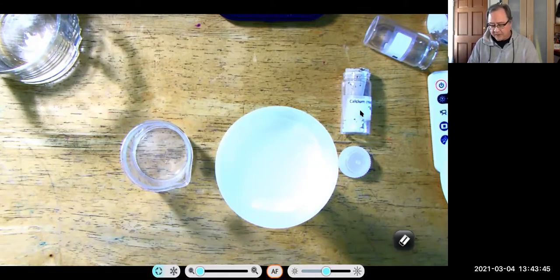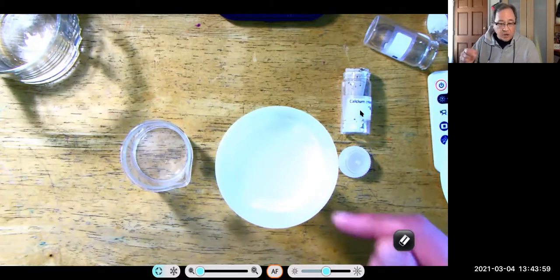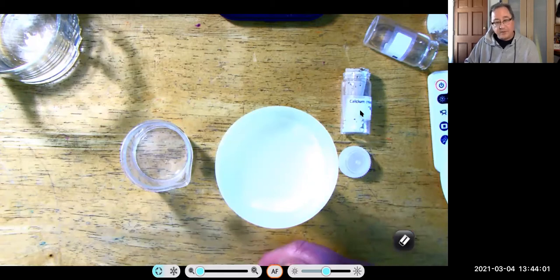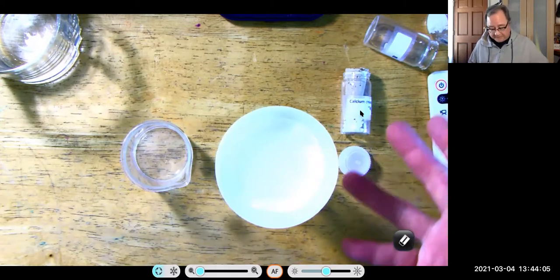There'll also be sodium ions and carbonate ions from your carbonate. And what is remaining behind here as a solid should be calcium carbonate. So remember, some of the calcium ions aren't used, so they will go through with the liquid.